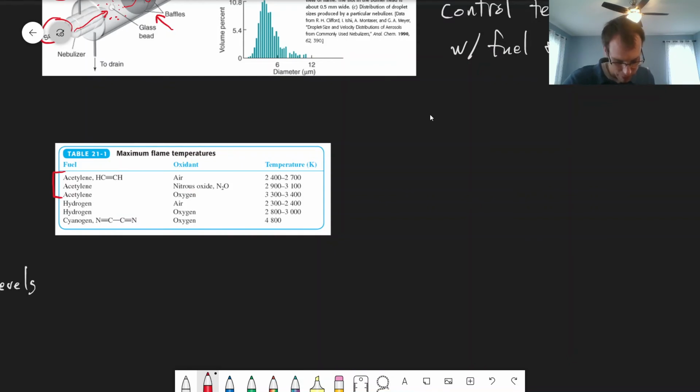And then the best oxidizer we can get is just pure oxygen. We are using oxygen with the air, but it's not pure, right? It's just whatever is in regular air. Pure oxygen can lead to an even further increase. Now, you can get to even higher temperatures. You can use hydrogen. But then, of course, this also becomes more dangerous, as hydrogen is highly reactive with oxygen, which is the point, which is why we're using it for this. And that can get us almost up to 3000 Kelvin if we want to do that, right? If we look over here.